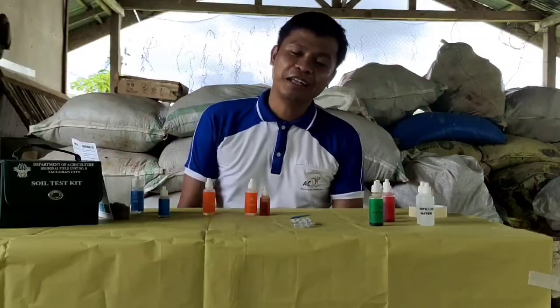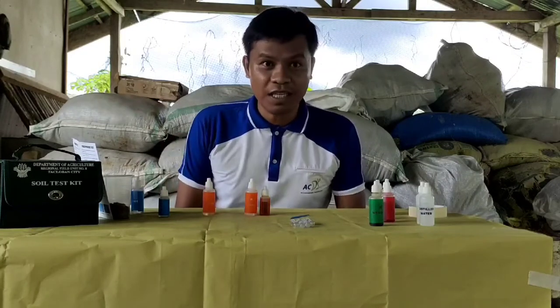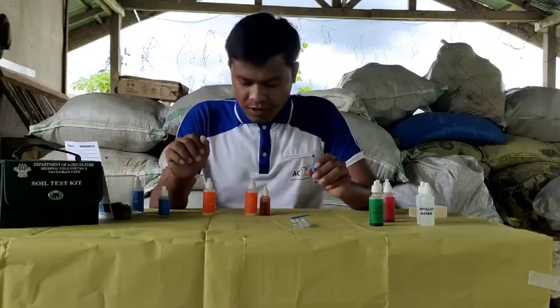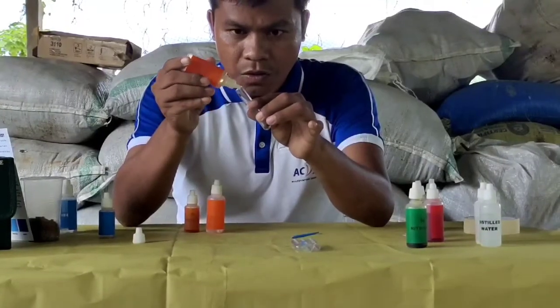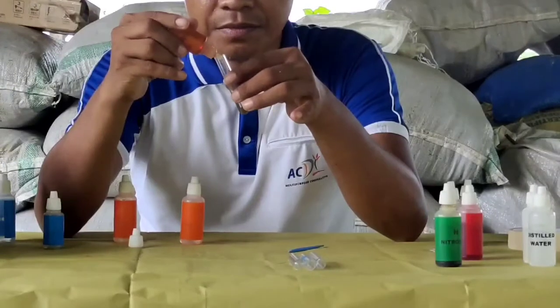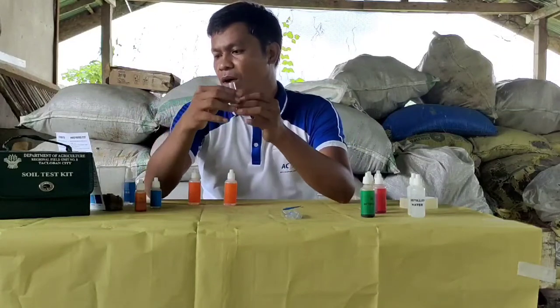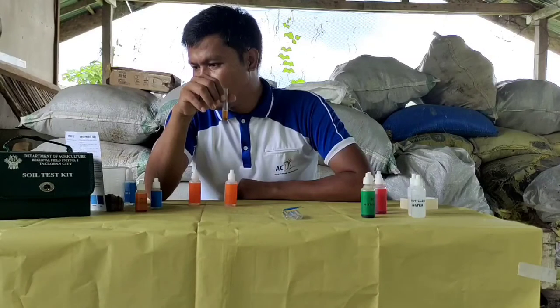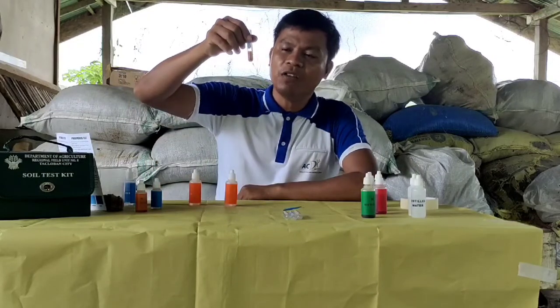Okay mga kaare, andito na po tayo sa pinakahuli nating test — soil potassium test. This is our test tube. We put some soil here. We add 24 drops of solution potassium and 8 drops of solution K1. We mix it for about 1 minute. Repeat after 3 minutes and let it stand for 5 minutes.